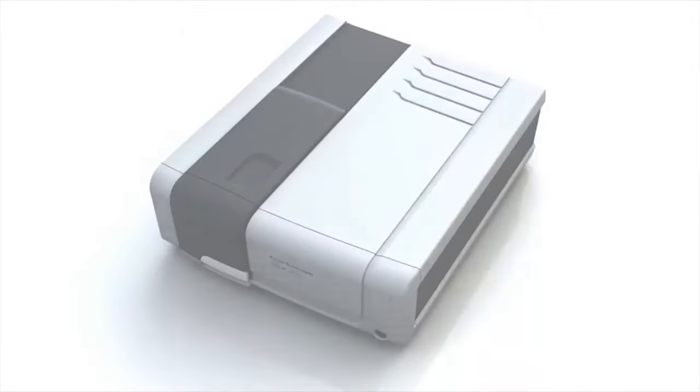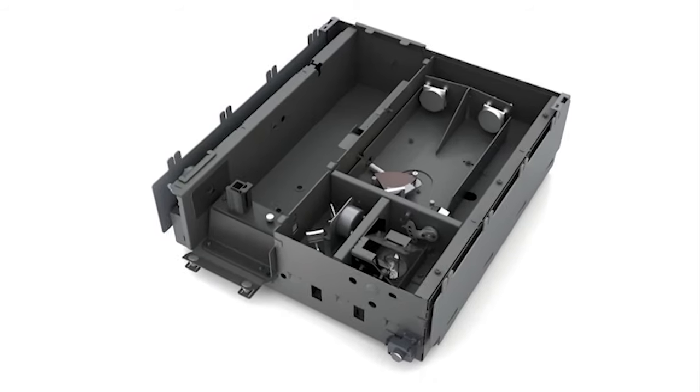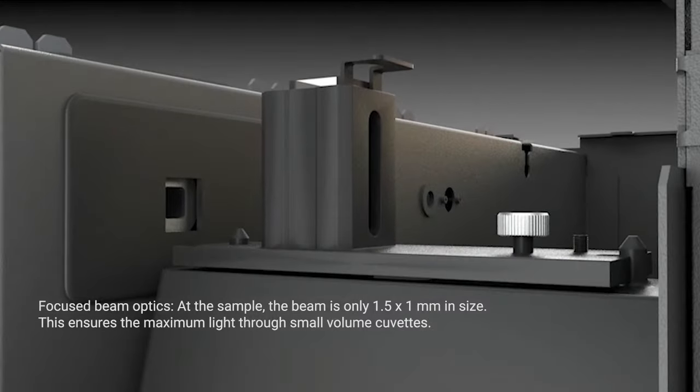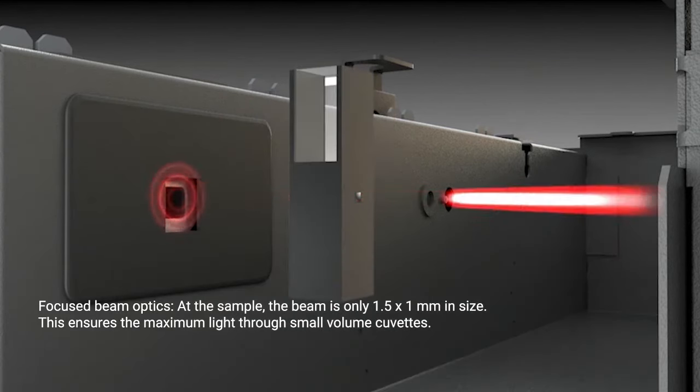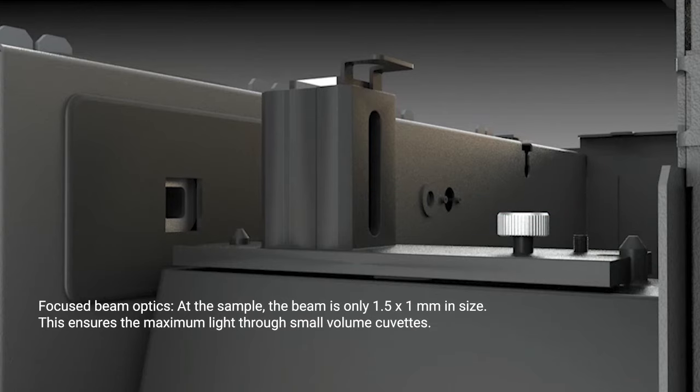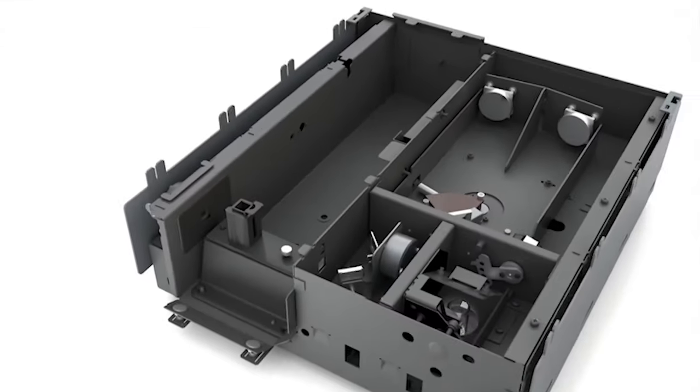The design feature of the Cary 60 that allows us to get this energy throughput is from a feature called focus beam optics. What we do is that we focus our beam down to be 1.5 millimeters by 1 millimeter, so all the energy from the instrument is focused down into that point. And that's why we can get through these small volume cells and maintain our signal-to-noise.